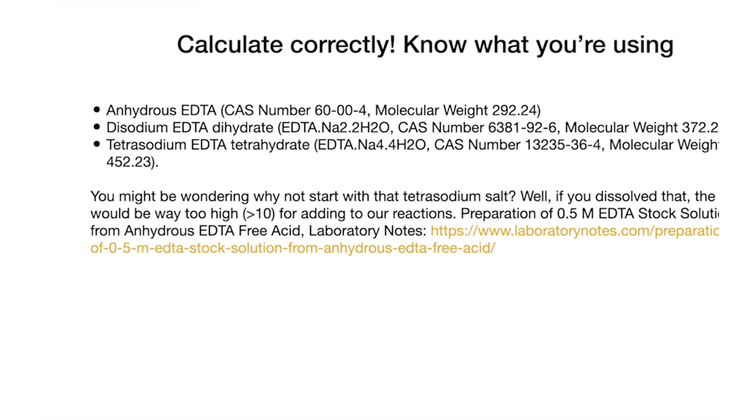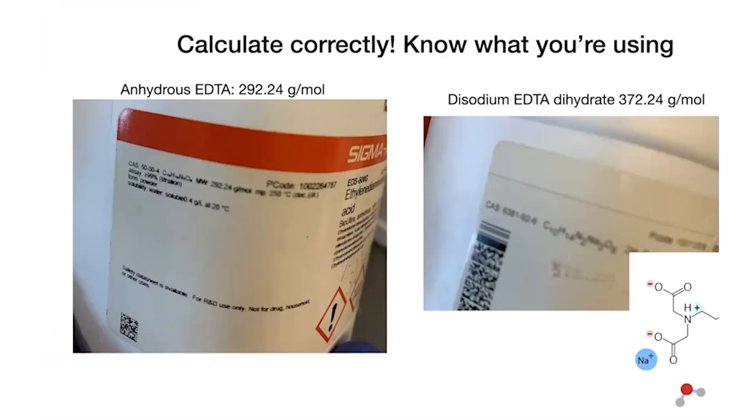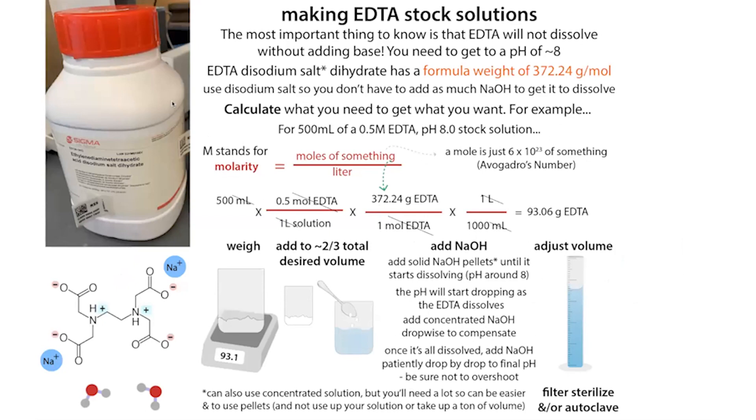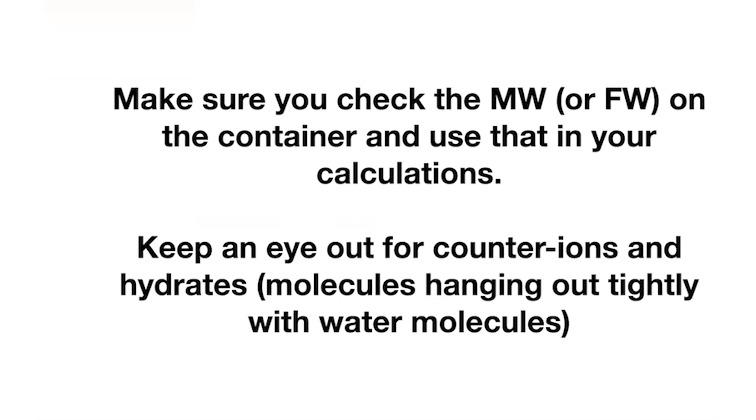When you go to make your calculations, you need to make sure you're looking at the label of your reagent and know exactly what you're using. Remember to check your labels before you make your solution. Looking online for recipes can be really helpful — to learn about special considerations like needing to add NaOH for EDTA, storage conditions, filtering, or autoclaving — but make sure those calculations use the same starting chemical as you have. Check the molecular weight on your bottle, not just what Google tells you. Good luck making your solutions.